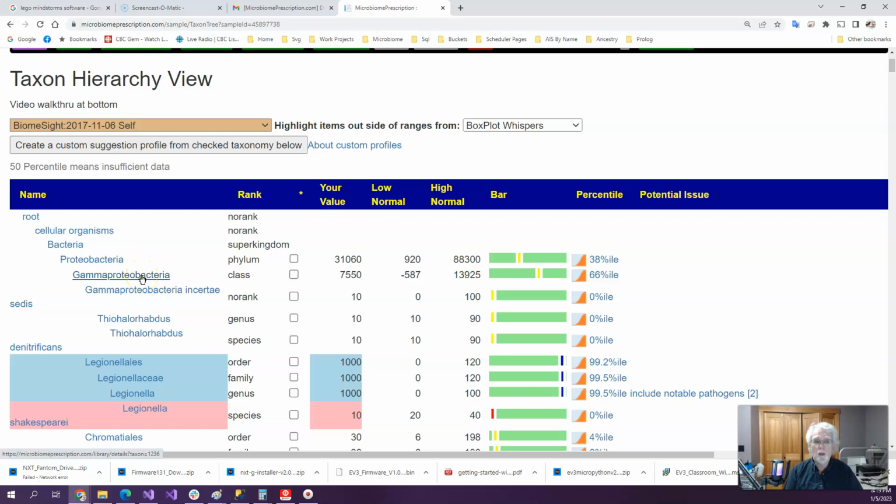Next level down could be a particular type of Pacific salmon, such as pink or sockeye. Next level down could be sockeye salmon caught in Alaska, etc. So anybody belonging to here also belongs to that. This is a particular type of fish, and it belongs to fish. So the same thing happens with the bacteria.